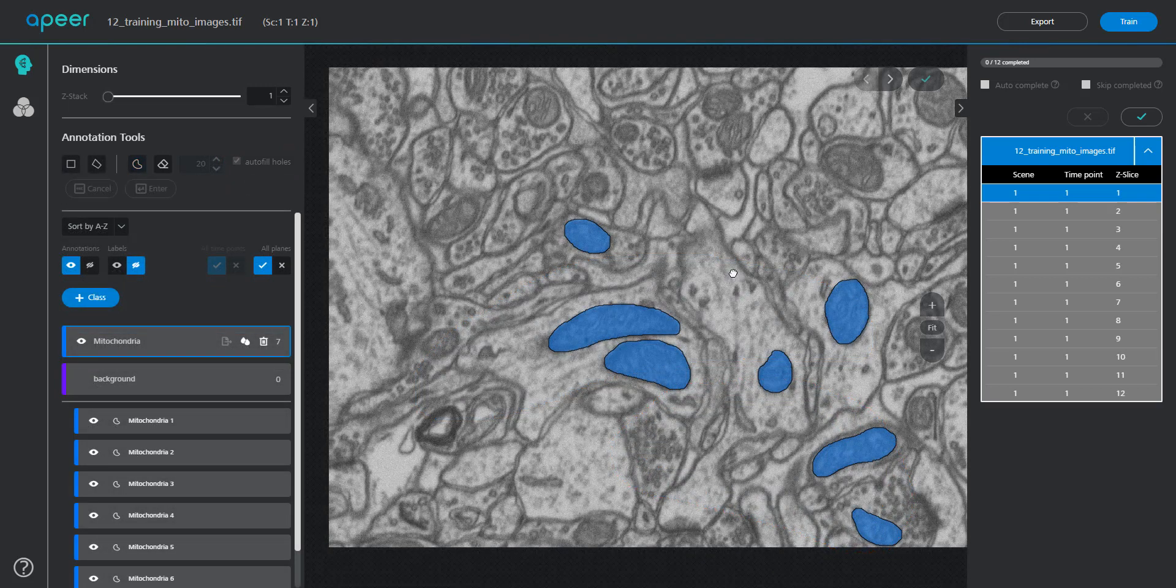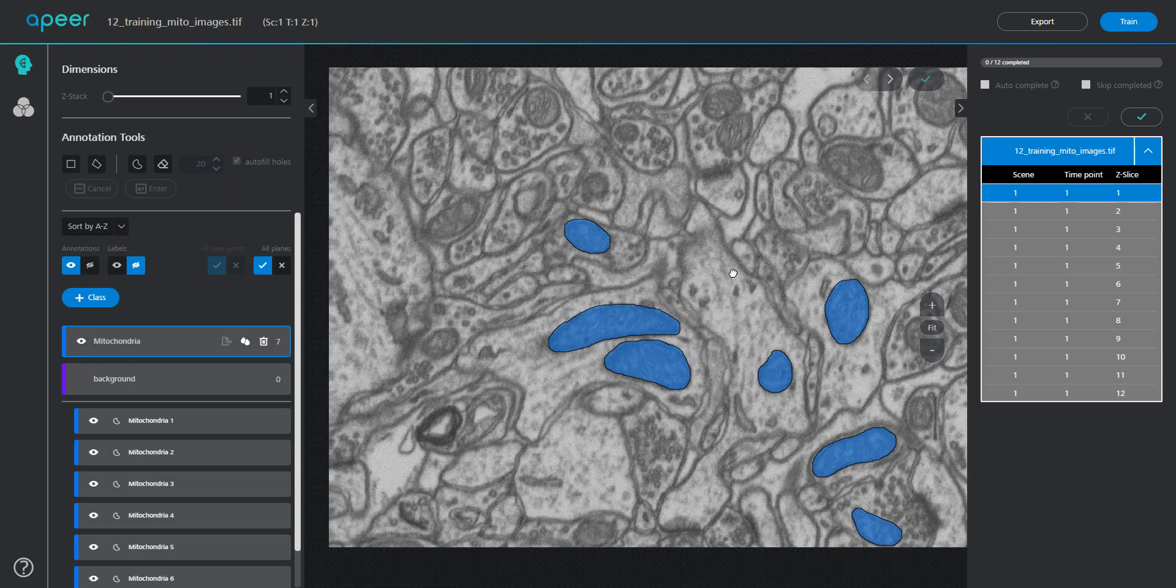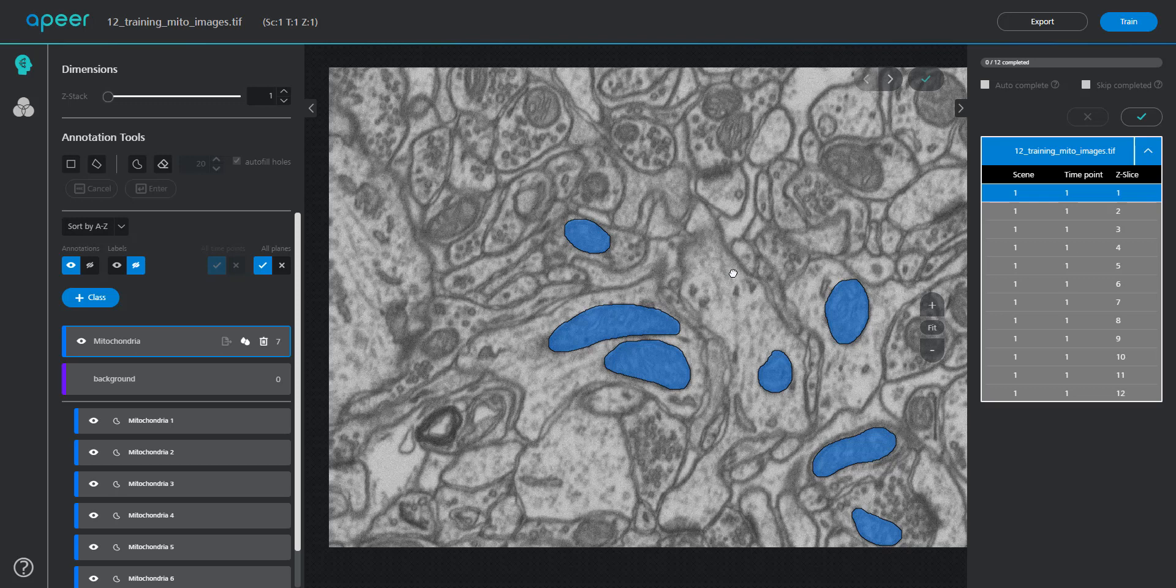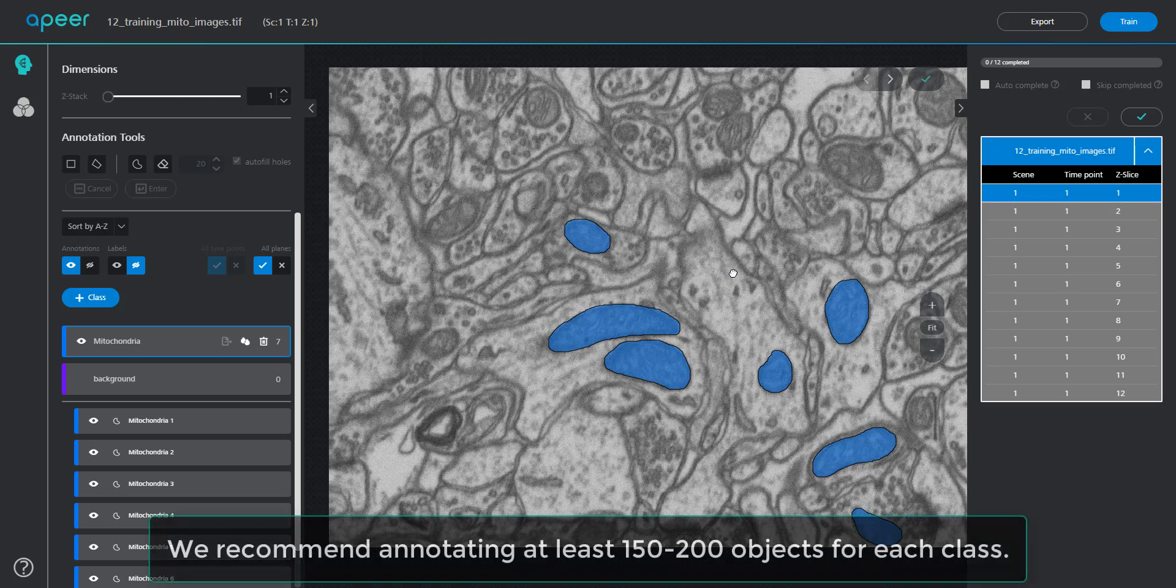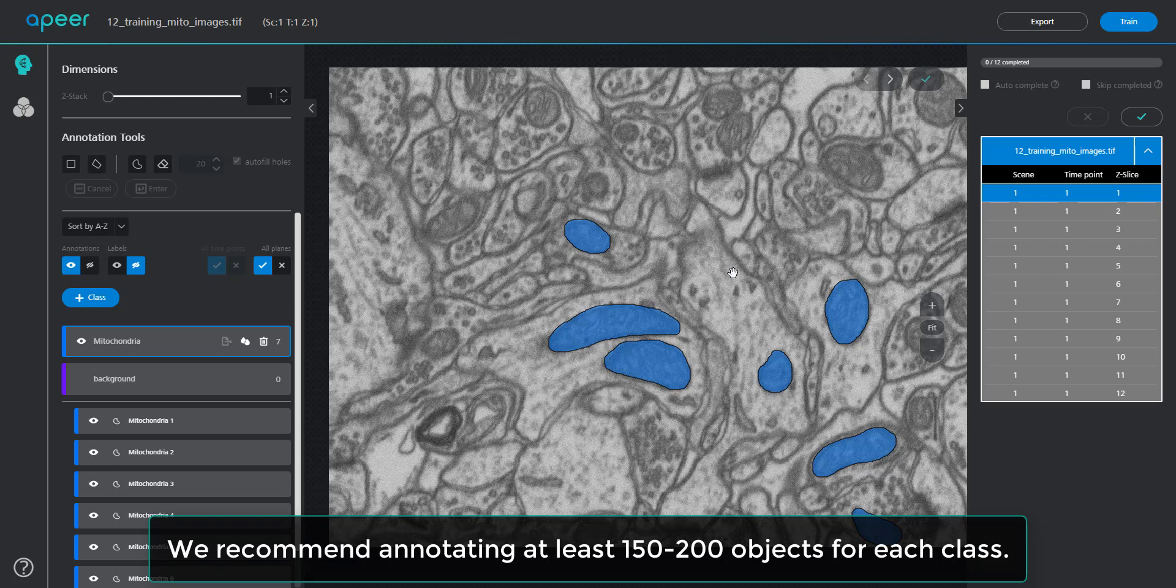You do not need to annotate every pixel in every image, but please make sure you annotate enough pixels. We recommend annotating at least 150 to 200 objects for better representation to the training model.